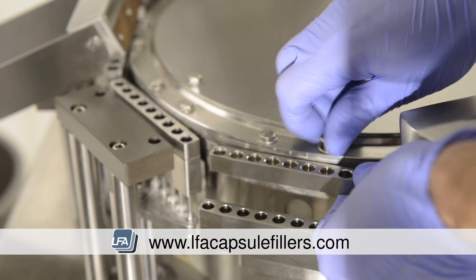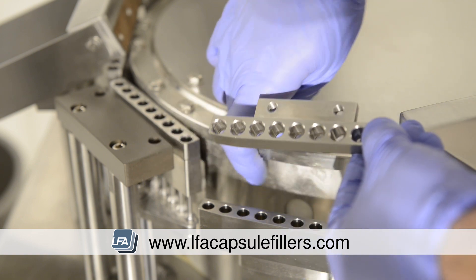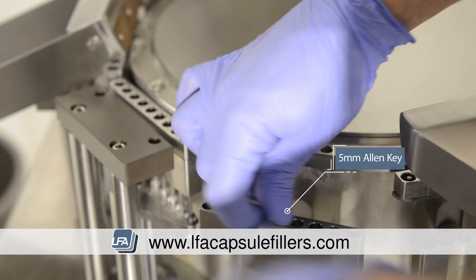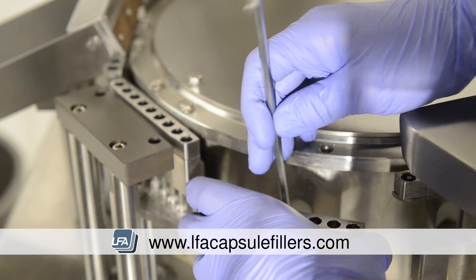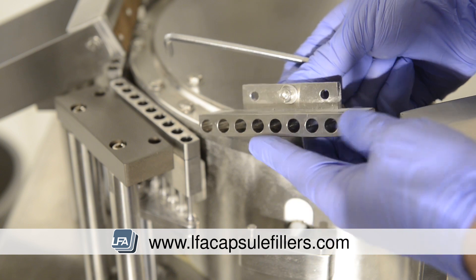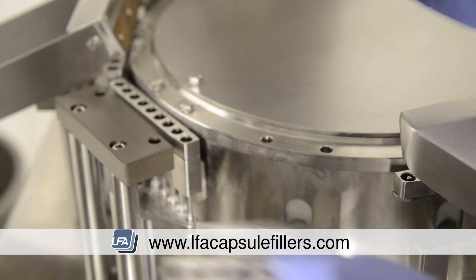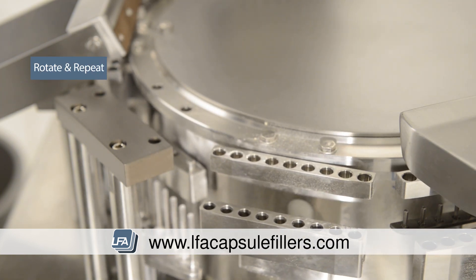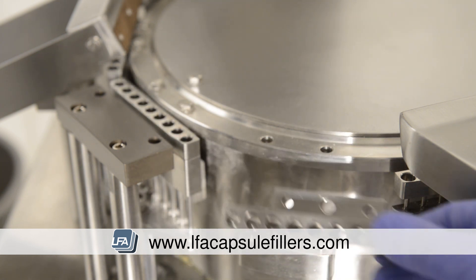Take your spanner and remove the two bolts shown here. Now take a 5mm allen key and place it in the bolt behind the bottom section of the tooling and undo it. This will release the bottom section. Rotate the machine by hand so your next station is in position and repeat the process.